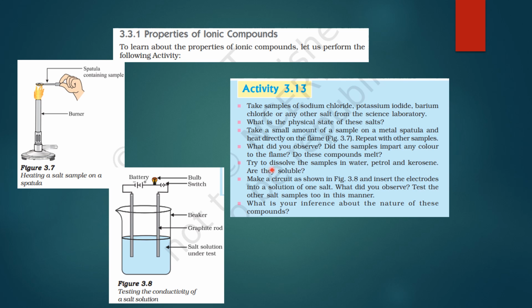Now you try to dissolve the samples in water, petrol and kerosene. Are they soluble? So we check whether they are dissolving in water, petrol and kerosene, right?